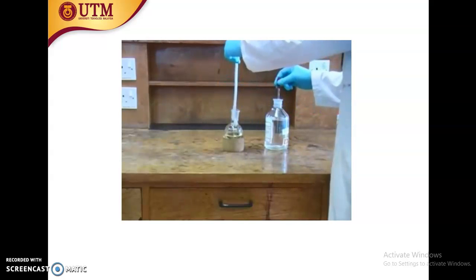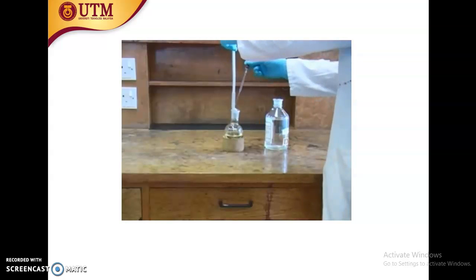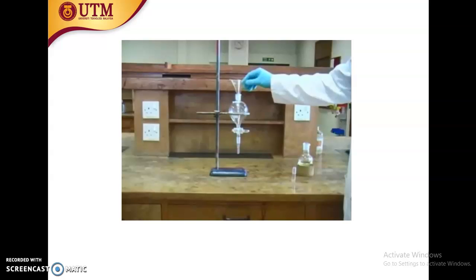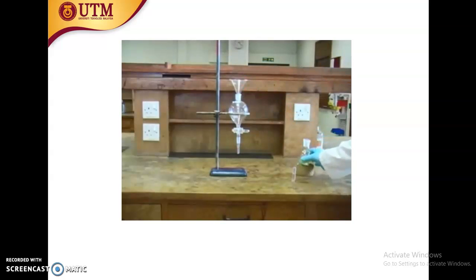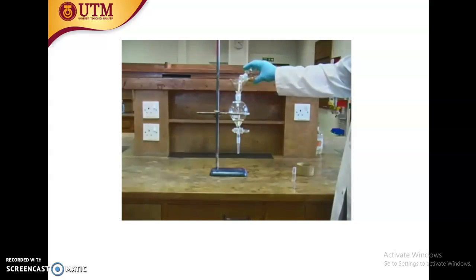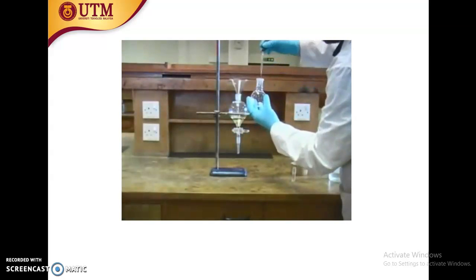The first step is to remove the magnetic stirring flea from the reaction flask. We need to wash this with ether to ensure that we don't lose any of our product. We now need to pour the solution of our product into the separating funnel, taking care to avoid any spillages. So it's wise to use a small glass funnel as we pour. Then we can rinse our reaction flask with more ether to ensure that no product is lost.